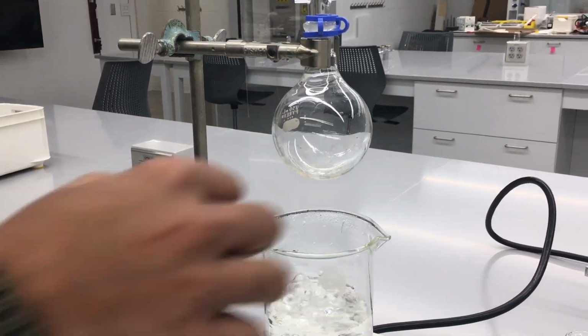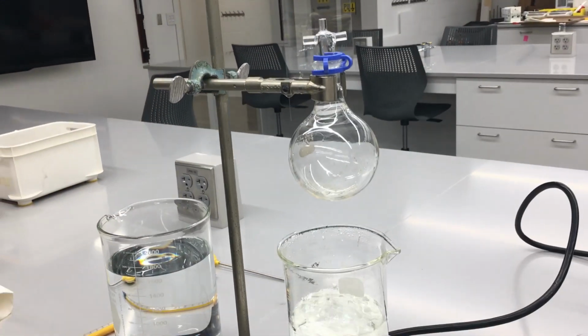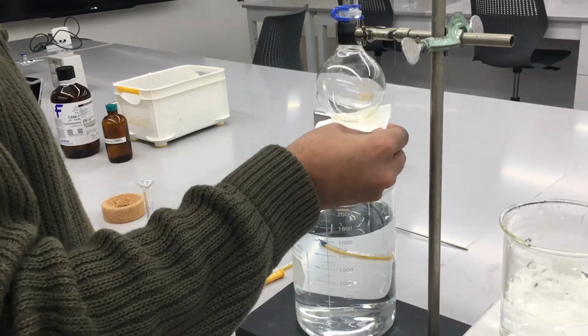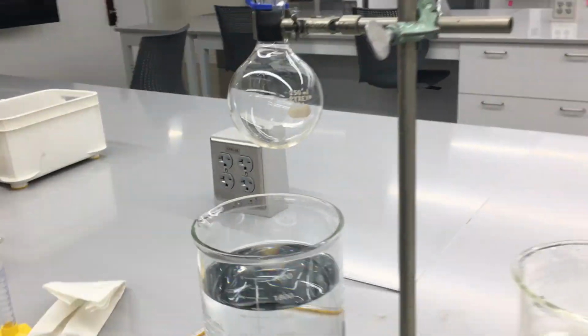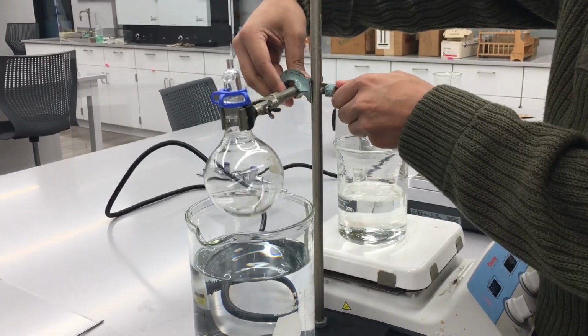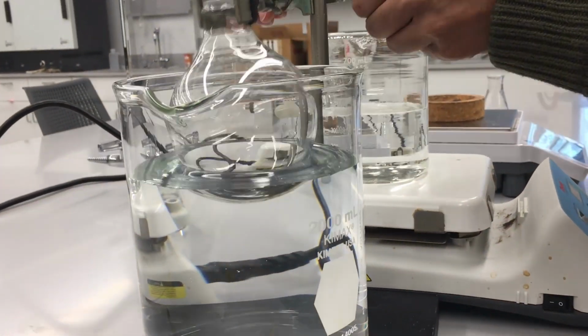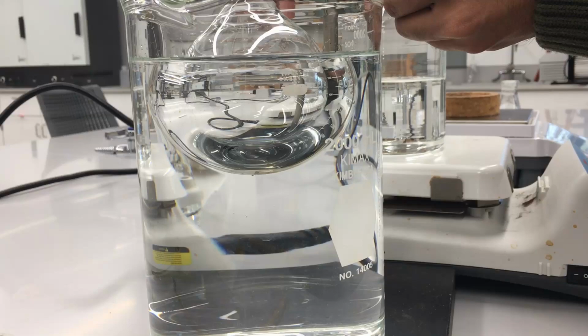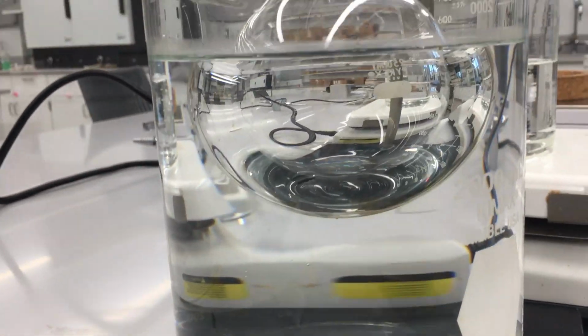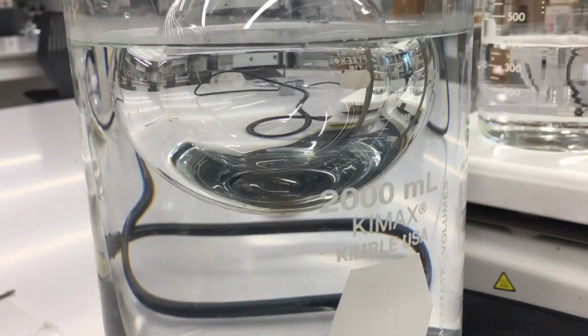All right, so now that we've completely vaporized it, we can go ahead and remove our round bottom flask from our boiling water bath, and we'll move it over to our cold water bath. So of course, this will, as in the other trials, condense our volatile gas into a volatile liquid. You can see the liquid beginning to pool at the bottom of this flask.